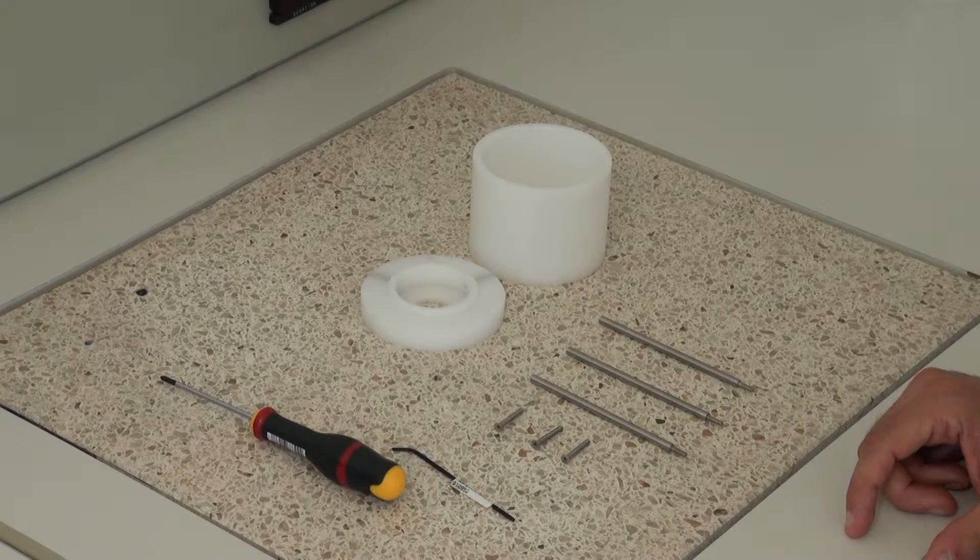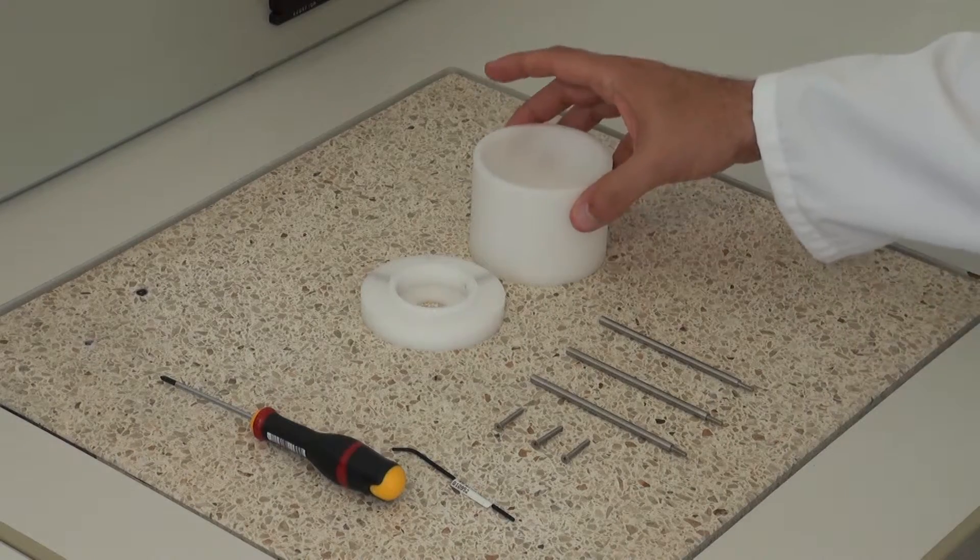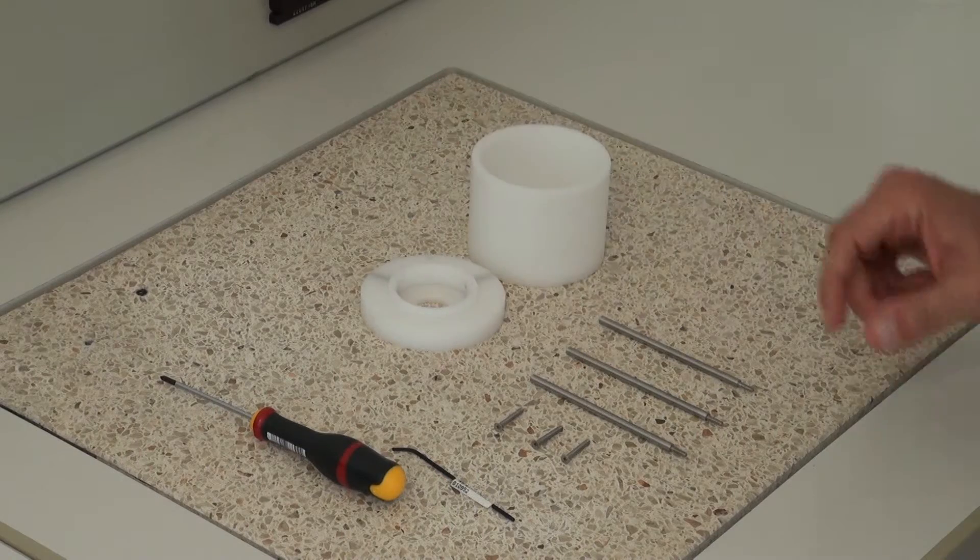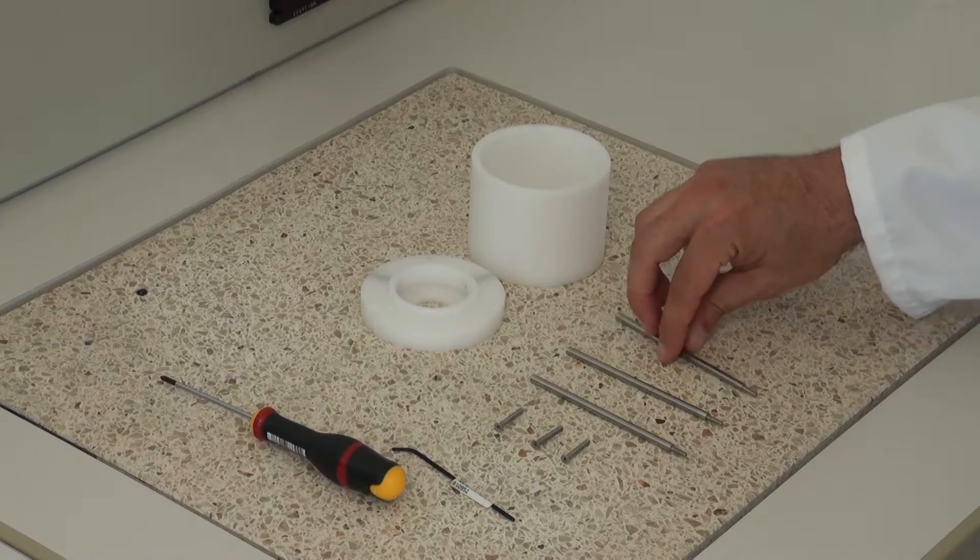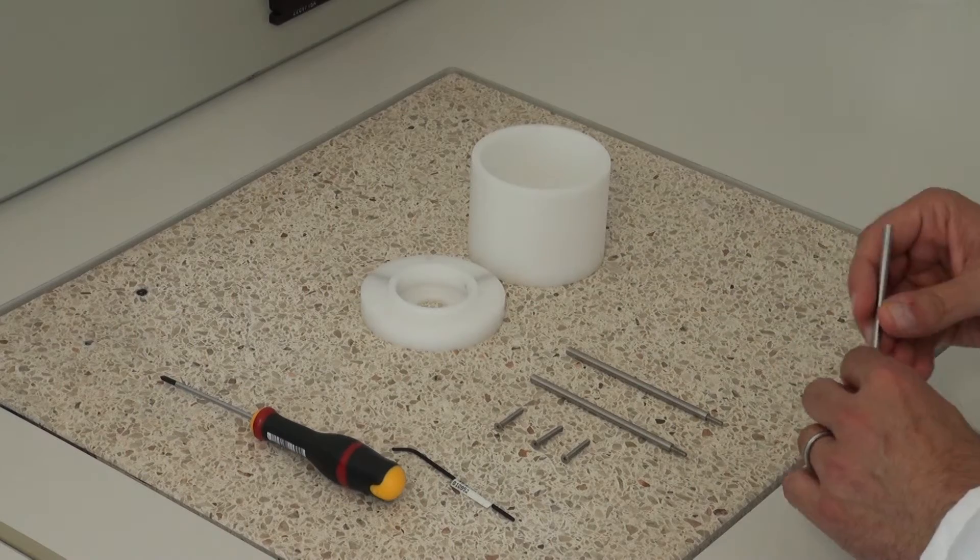Let's come to the construction. The protection cage consists of two pieces, a lid and a base. With the help of threaded rods, they are screwed together.